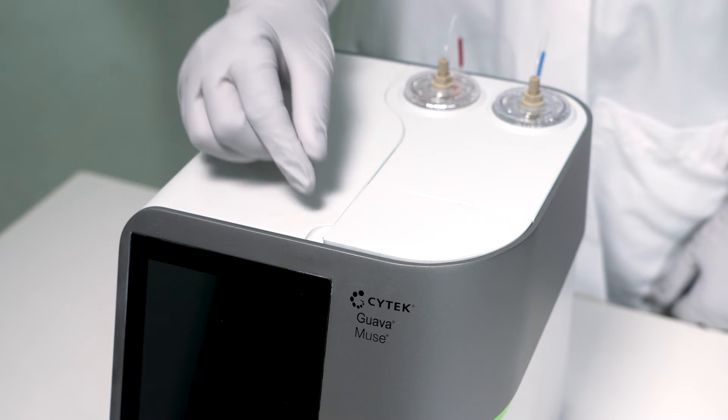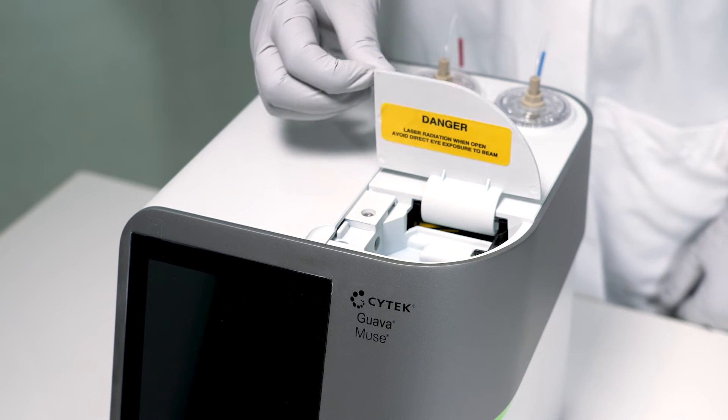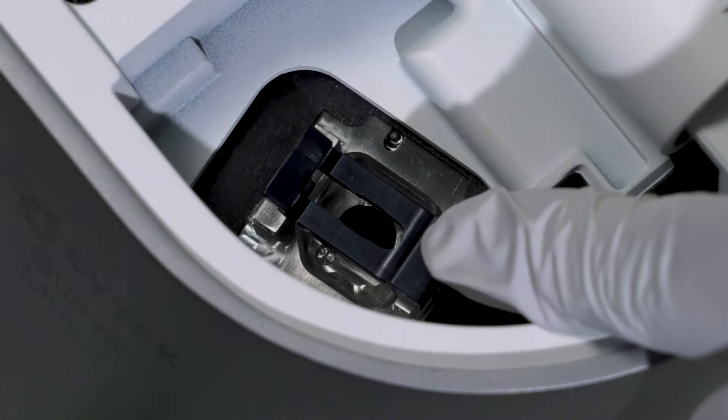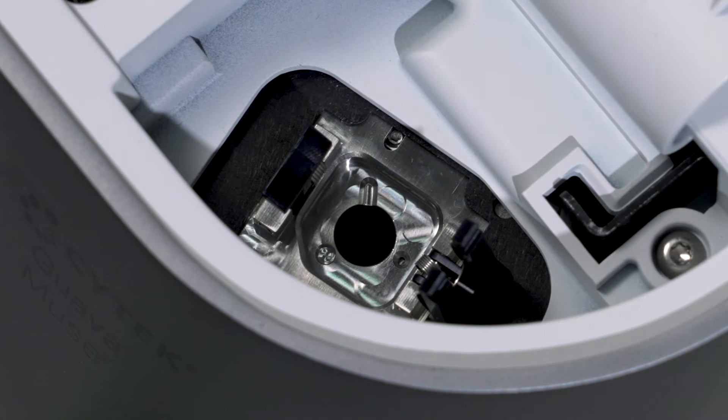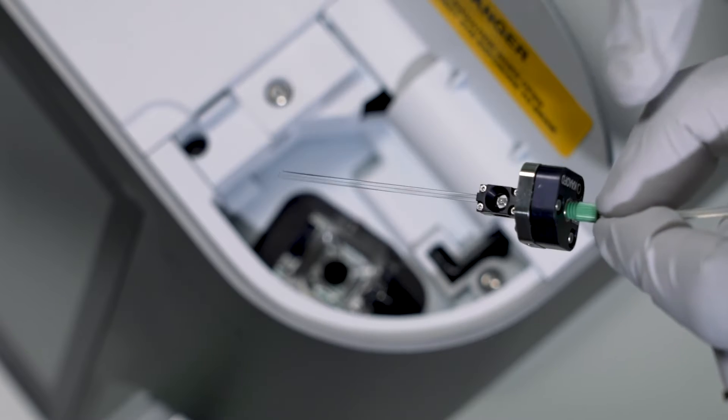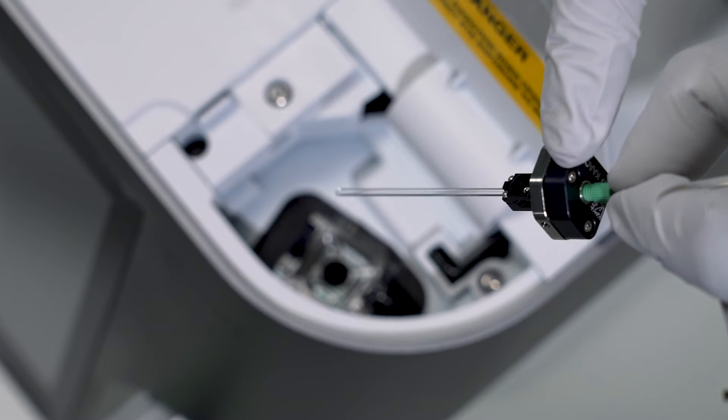Open the hatch on top of the instrument and locate the flow cell chamber. Press down on the left edge of the clamp. The forked side will pop up automatically. This is where you will install the flow cell.